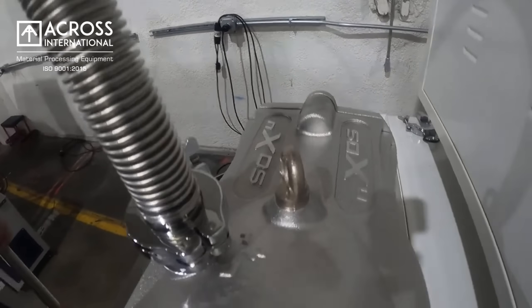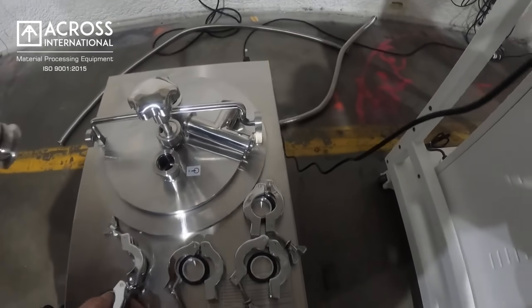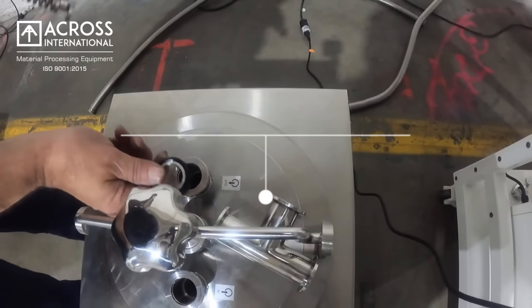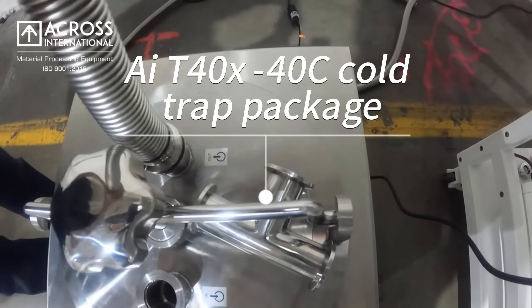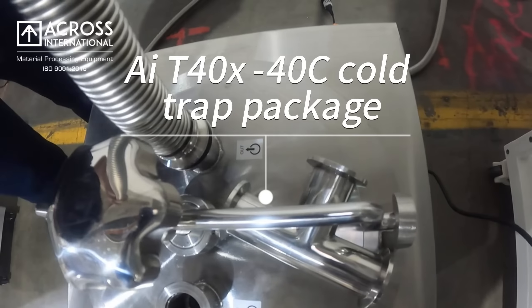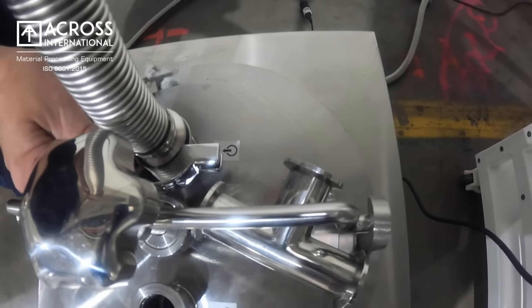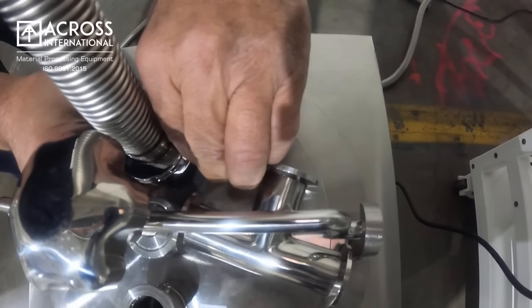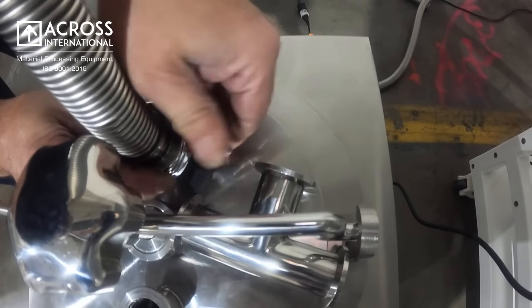Next we'll take the end of the bellow to the outlet on the cold trap, ensuring your seal is there. Secure it with your KF 25. Tighten your clamp.